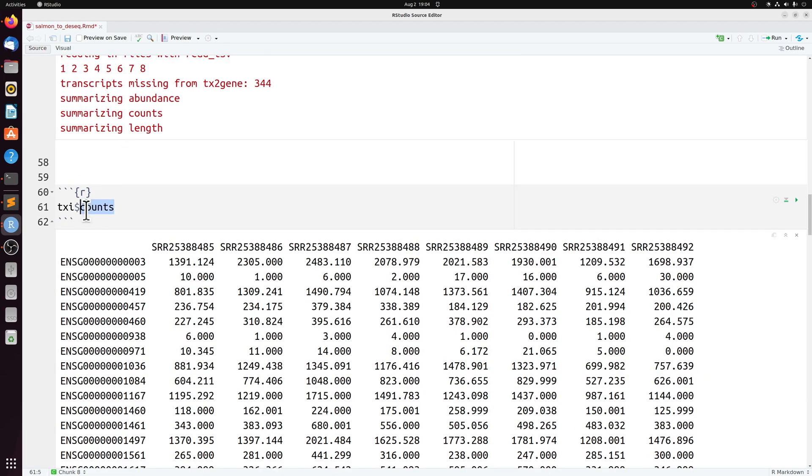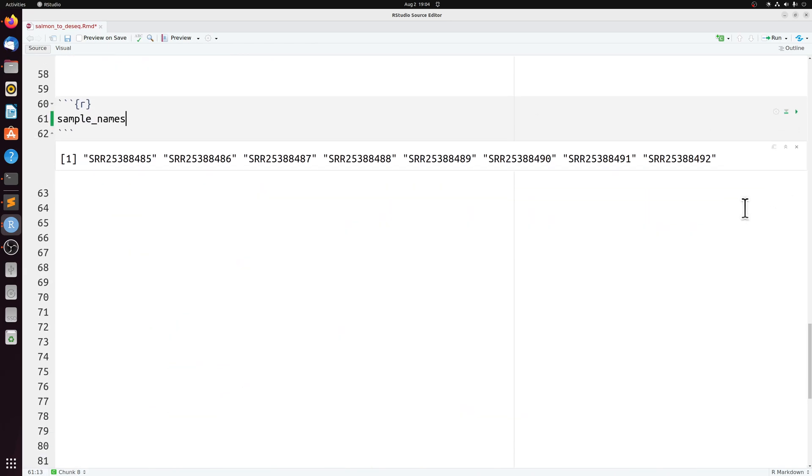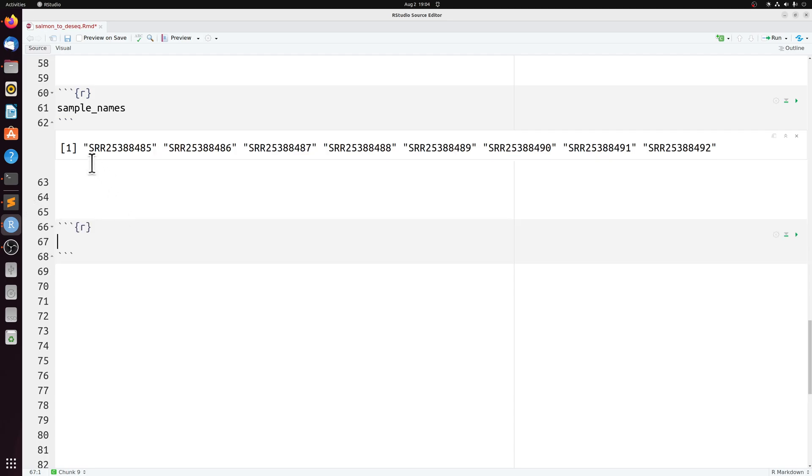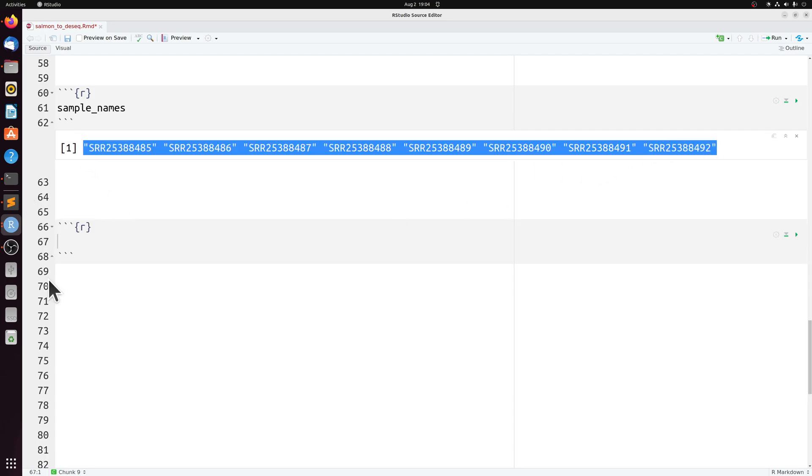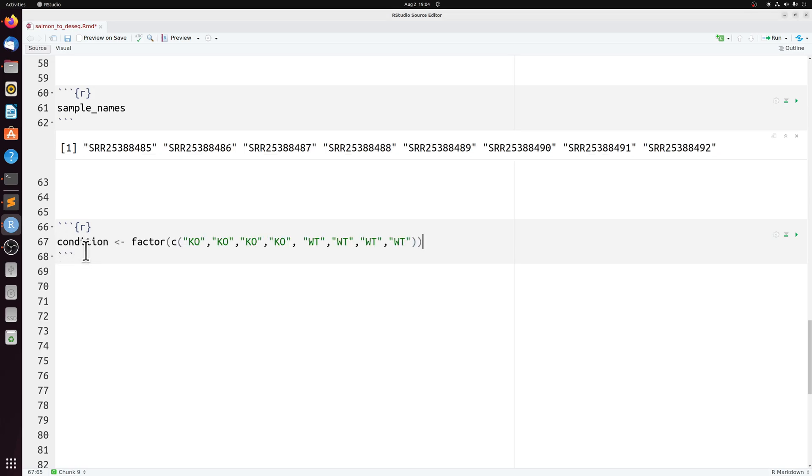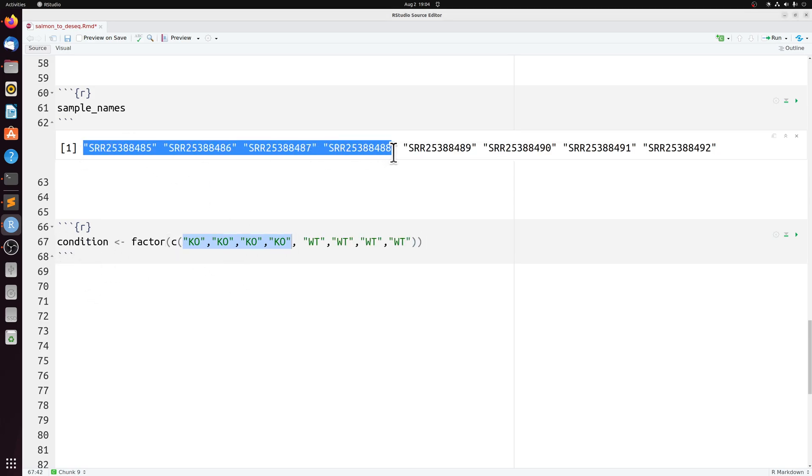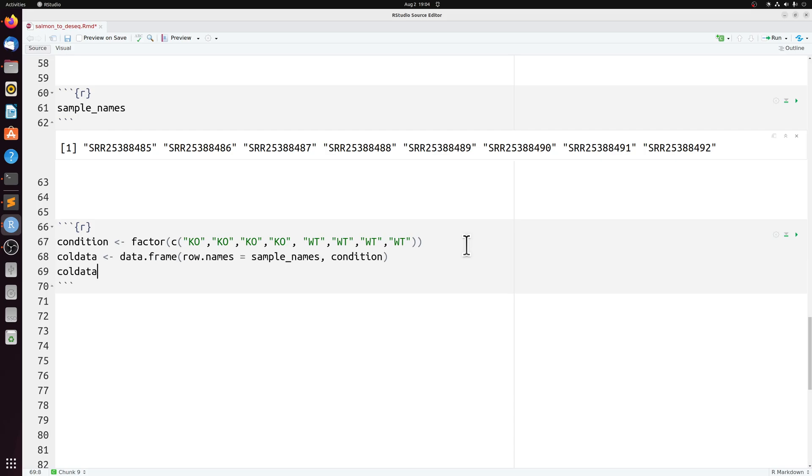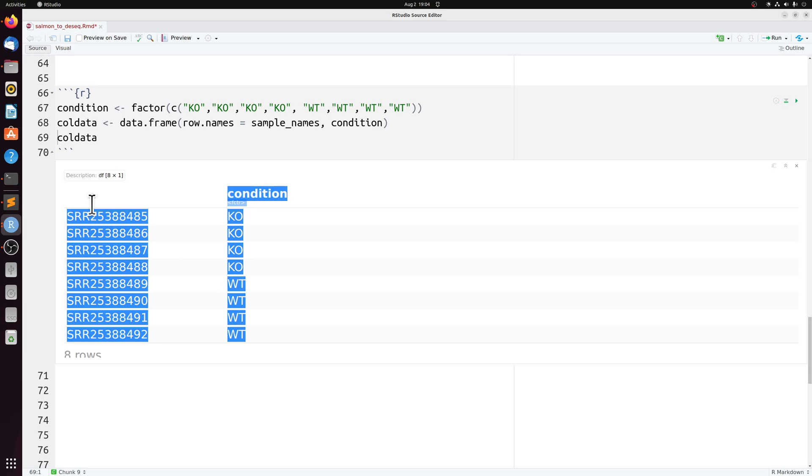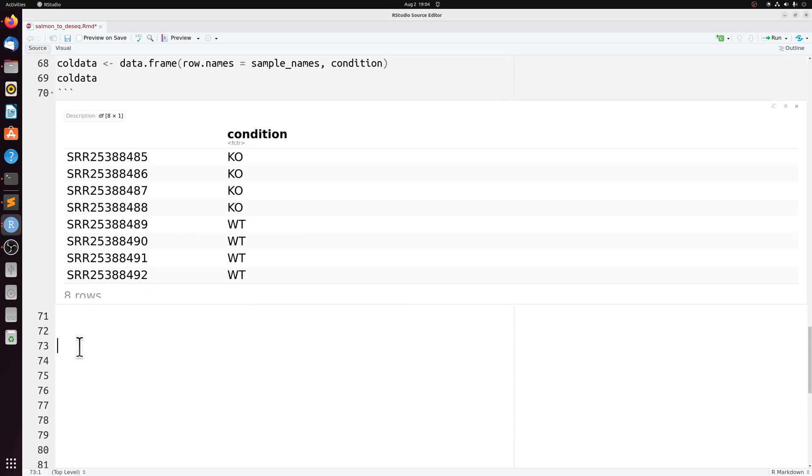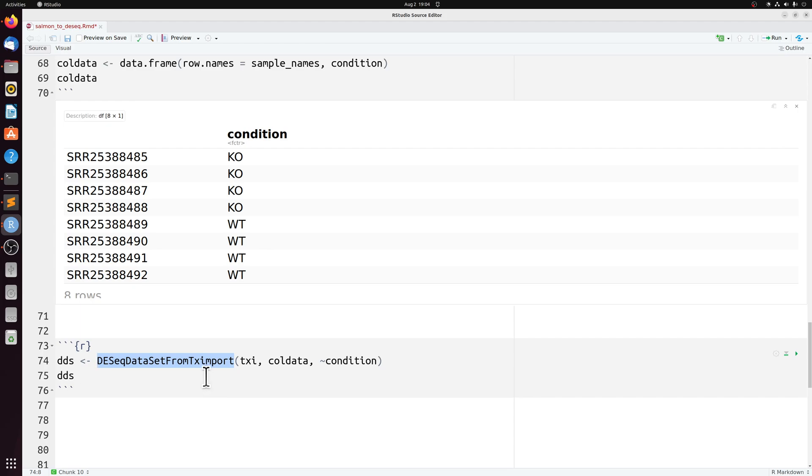But we're ready now to import this data into DESeq. So we're going to start setting up our DESeq object. So we have sample names here, which is just a list or a vector of our sample IDs. And I know which corresponds to which condition. So I'm just going to put that in here. The first four are knockouts and the other four are wild type. And then I'm just going to combine those two lists or vectors into this data frame where we have our ID and our condition.